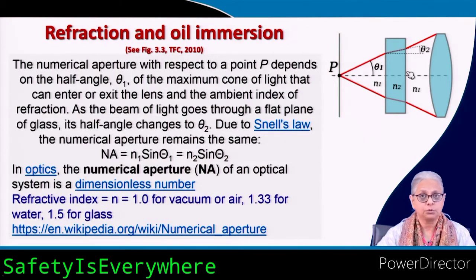So it passes right through, and if you don't stain the bacteria, you can't see them. So that's one issue. Now let's take a look at more. Some of the light will pass away. It cannot be collected, which is poor in terms of microscopy. Whatever comes to the object, in this particular case, you have some refraction of light.